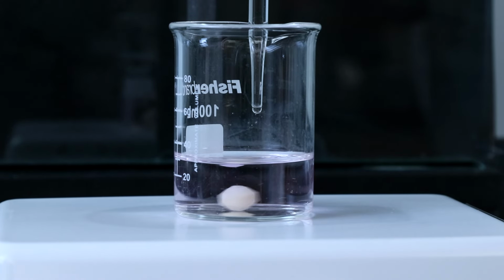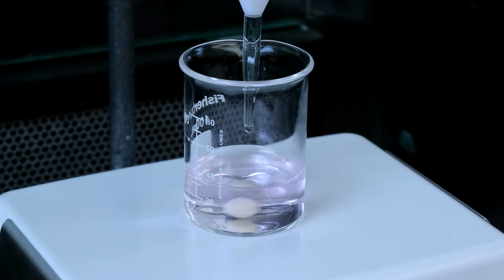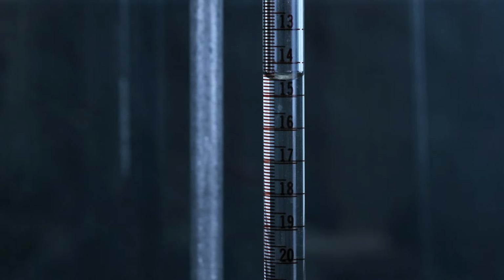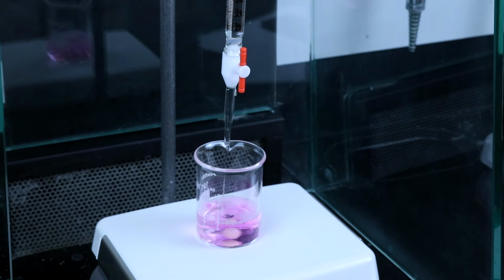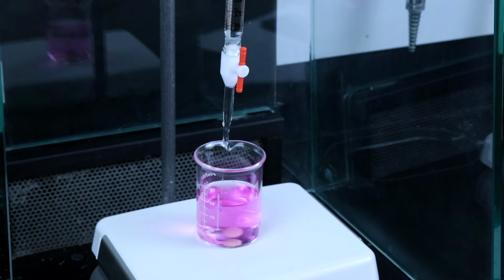Eventually the solution remains a pale pink color, and I continue to stir it just in case there is some unreacted acid in there, but after a few minutes it looks like it's going to remain that pink color. So the titration is done. And here's where the sodium hydroxide ended up. So it looks like only 3.4 milliliters of base were needed. Now I can drain the remaining sodium hydroxide in the burette out, and rinse it with water afterwards to make sure that all of the sodium hydroxide has been removed.